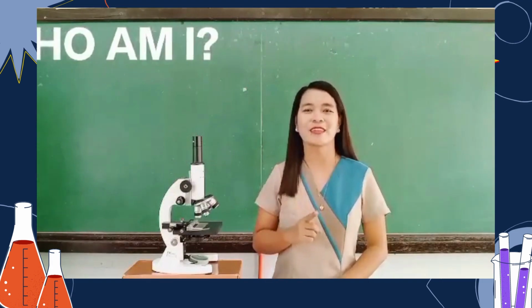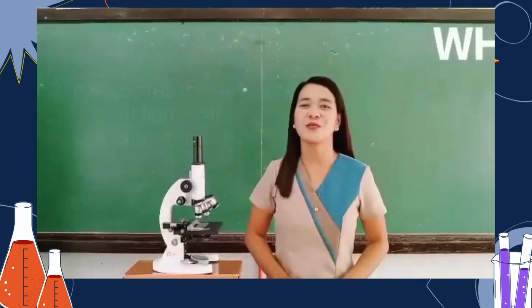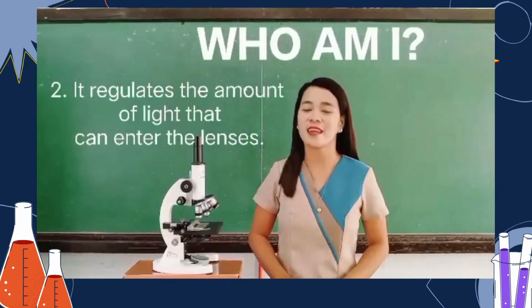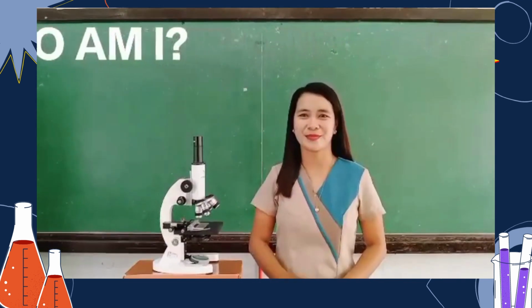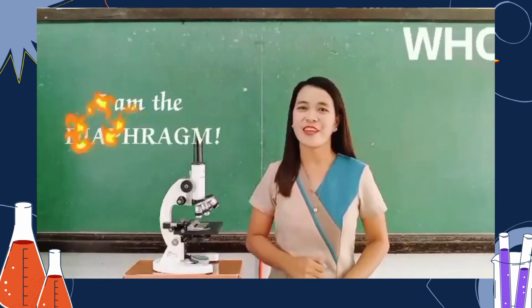Yes, you are correct. I am the eyepiece. Question number 2. It regulates the amount of light that can enter the lenses. Who am I? Yes, you are correct. I am the diaphragm.